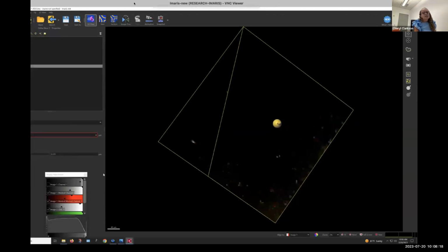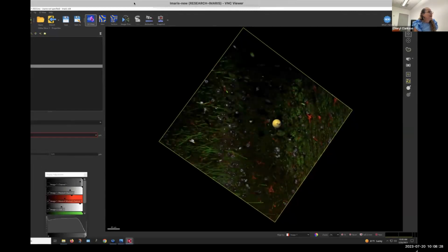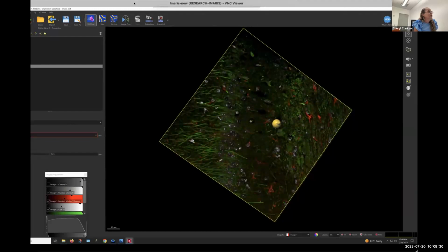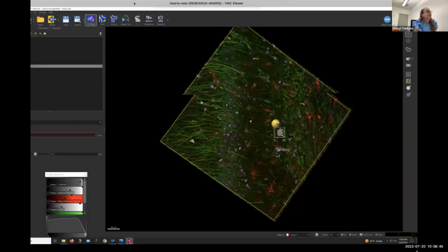So now you can see I'm starting to move in the volume, and you can see how it's showing up. At the bottom of this yellow stuff, that is the ortho slicer, we have our target cell. And there we also have our SEM data that is coming from the volume scope.